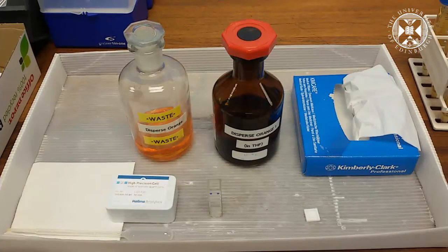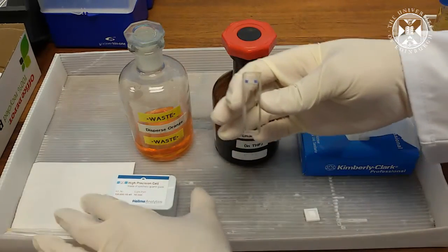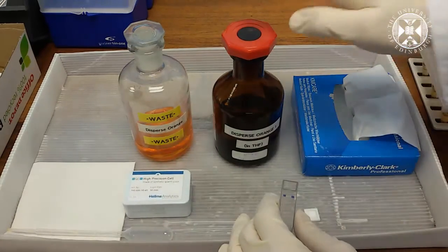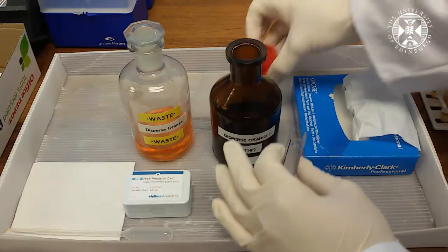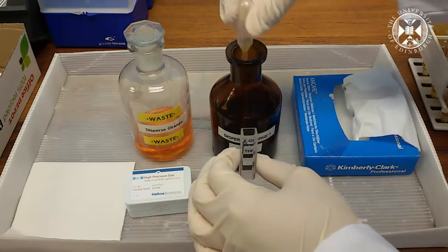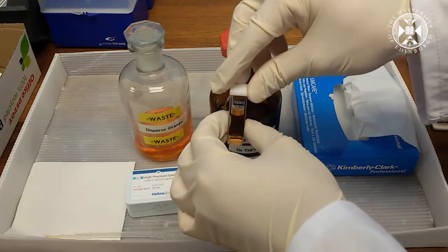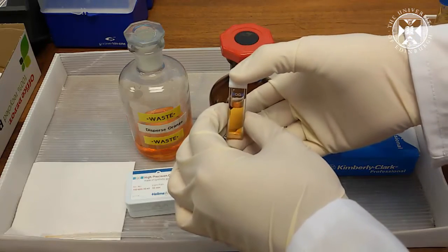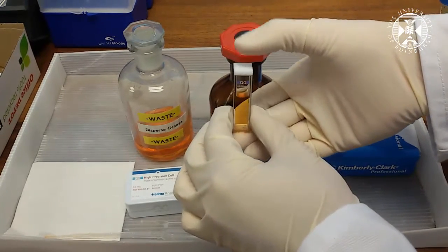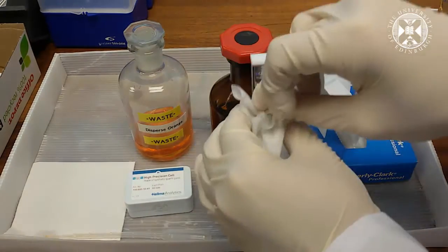To fill your sample, use the glass cuvette provided in this small box. Disperse orange is found in this bottle. Use the dropper to fill the cuvette, then use a small plastic stopper to seal it and prevent the solvent from evaporating. If you spill any on the sides, use a tissue to wipe it.